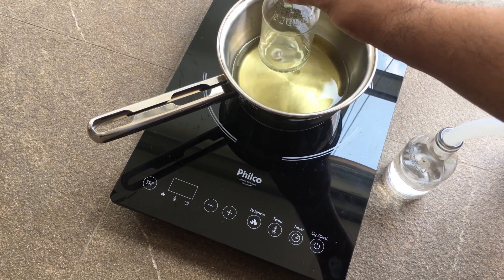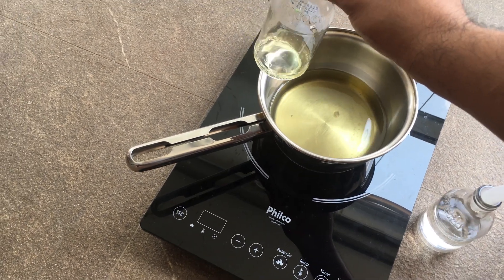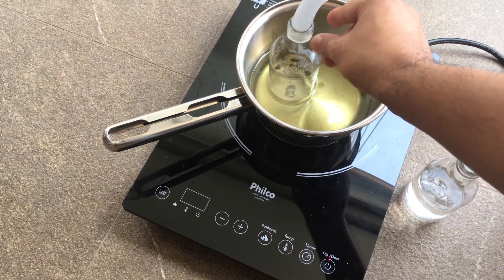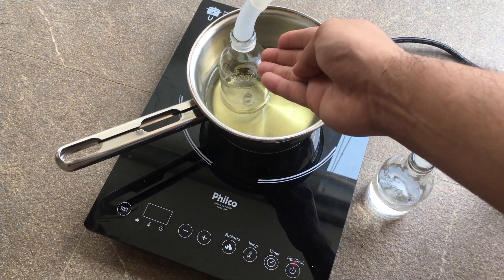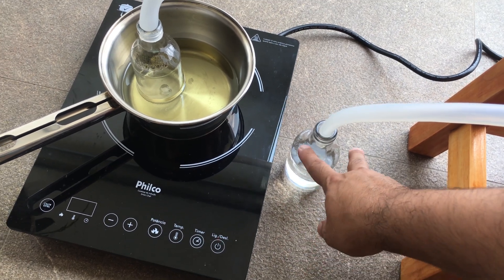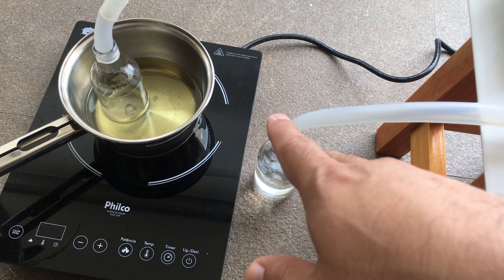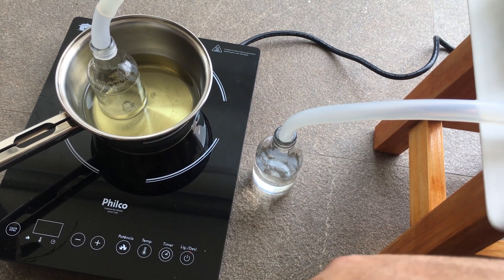Always use proper safety: you want lots of ventilation, don't grab hot glassware with your bare hands — this is actually really hot — and use common sense. No open flames, keep it well ventilated.